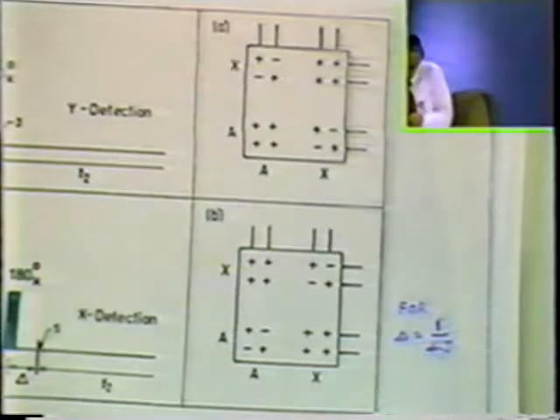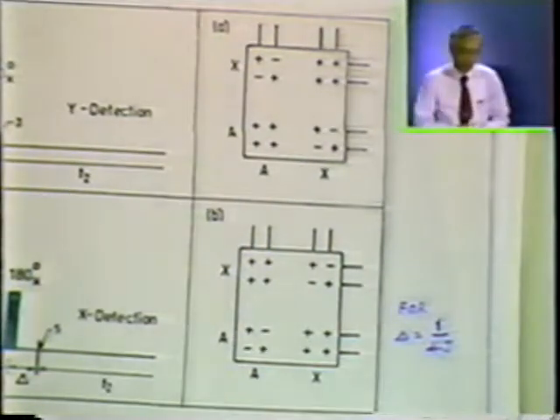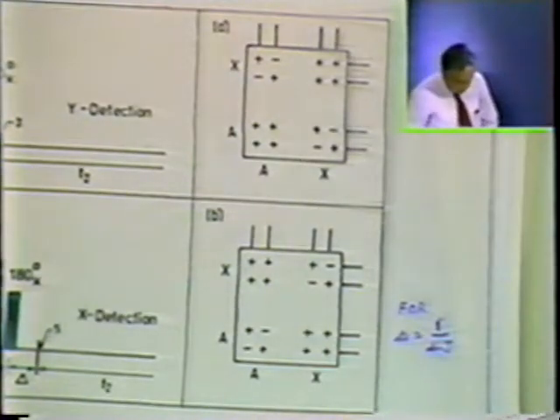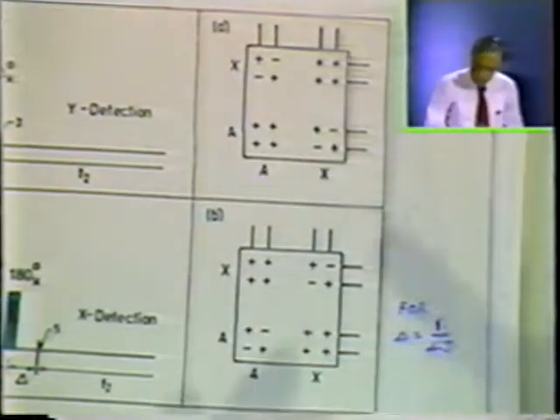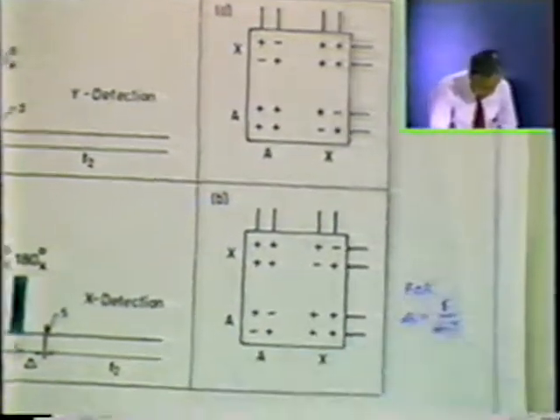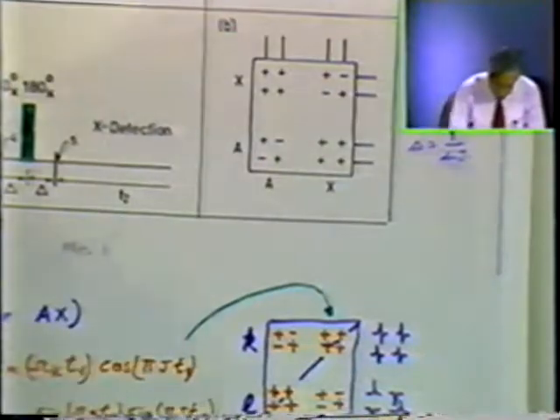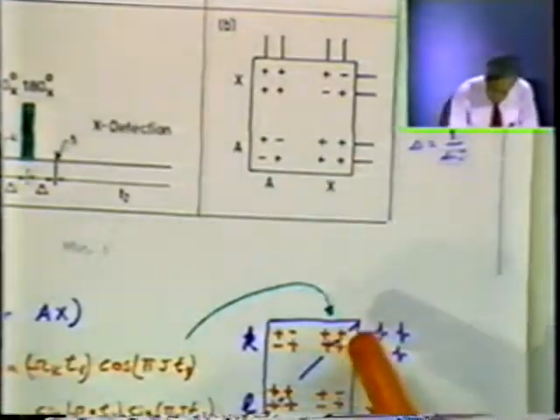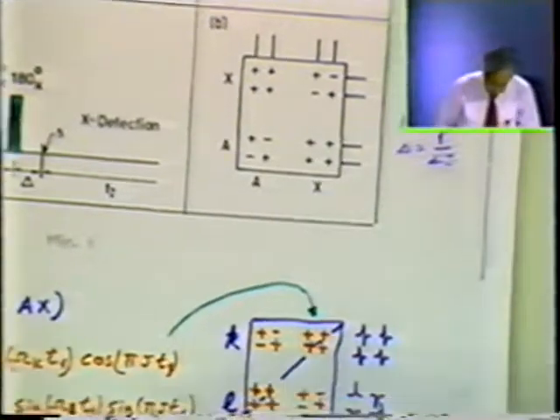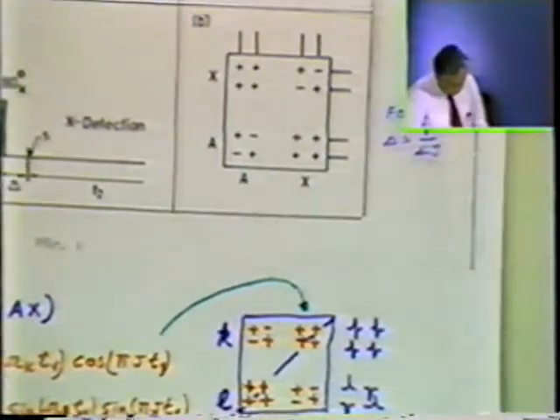There are cross peaks which lie very near to the diagonal, and for huge diagonals we are not able to see the cross peaks which are near to them, and therefore it has an added advantage. This is basically telling you exactly how these terms come about, and in the COSY experiment and the super COSY experiment, which magnetization gives cross peak, which gives diagonal peak. Okay, and experimentally it works.